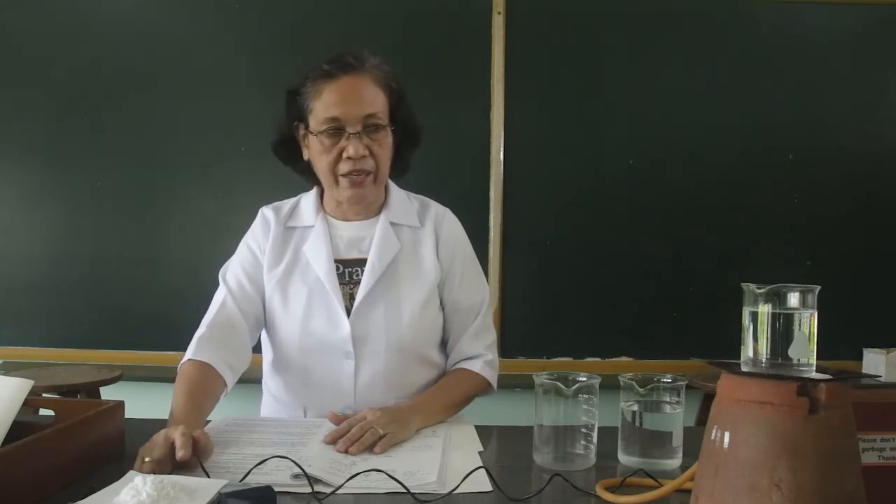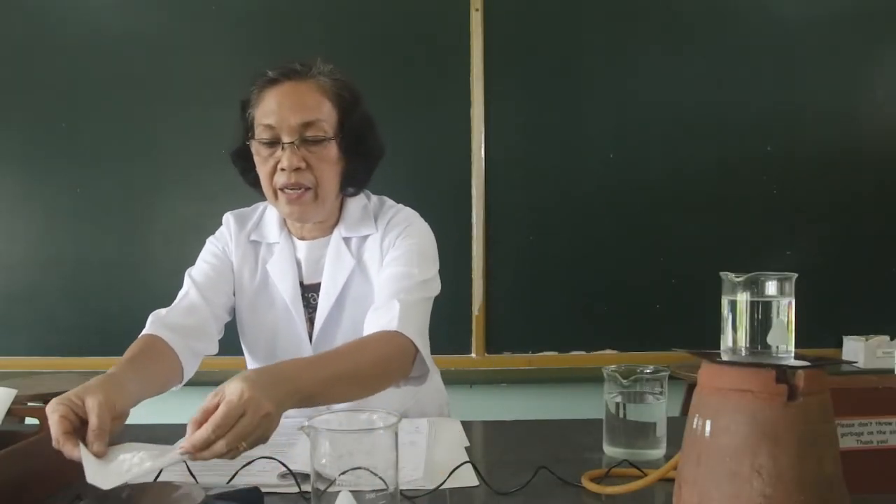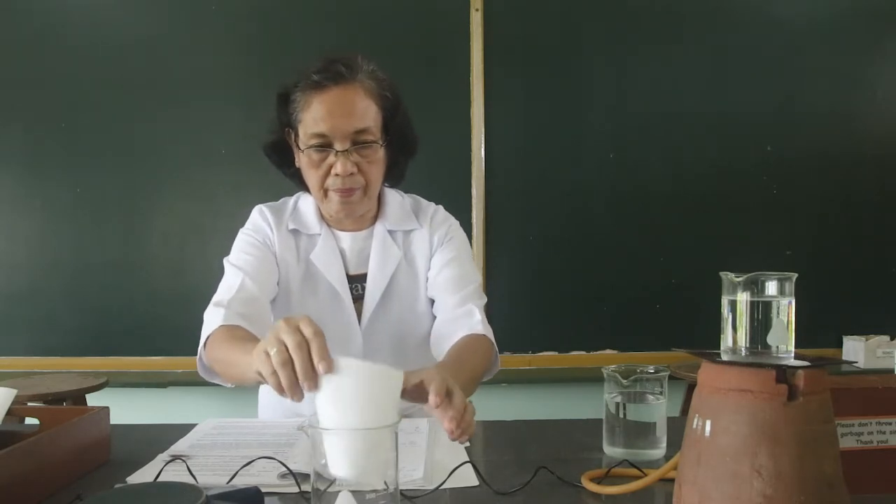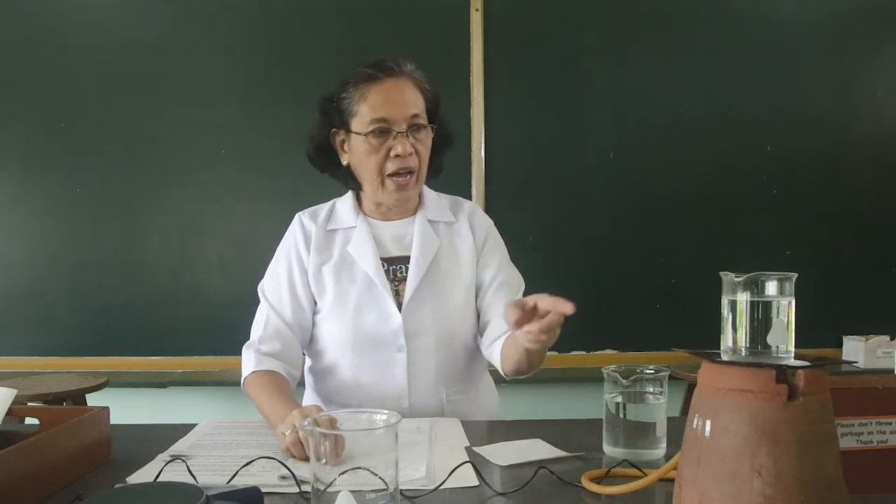As you can see here, it is already 6.8 grams. So this is the acetanilide. Let us transfer these acetanilide crystals into the beaker. And with the use of the hot water, we are going to dissolve it.